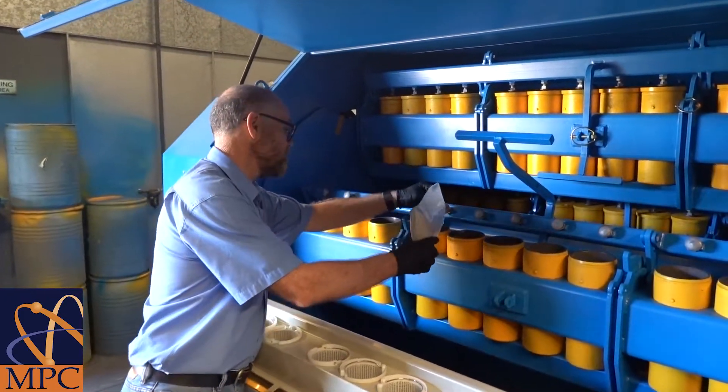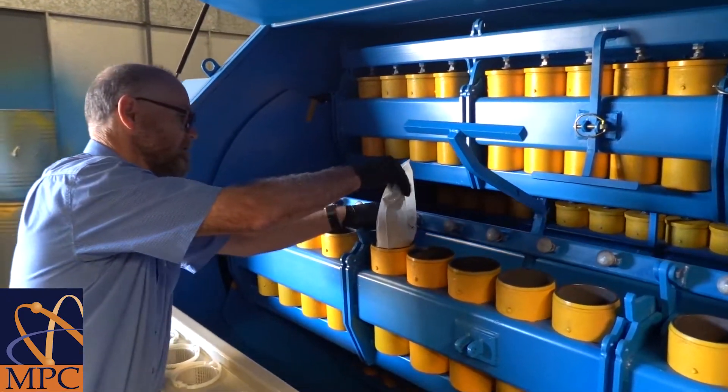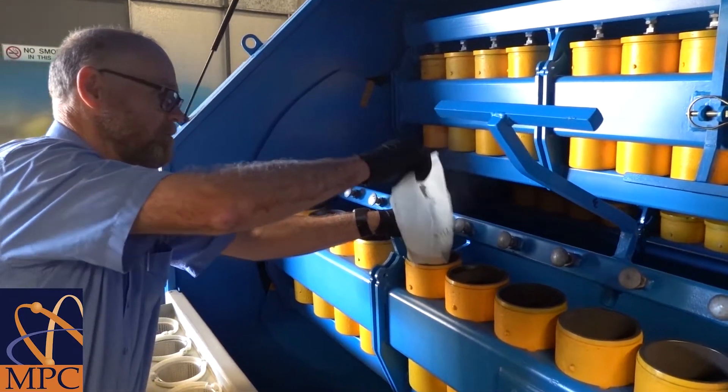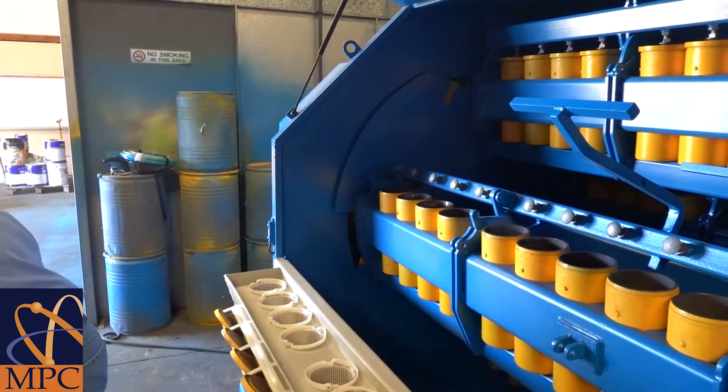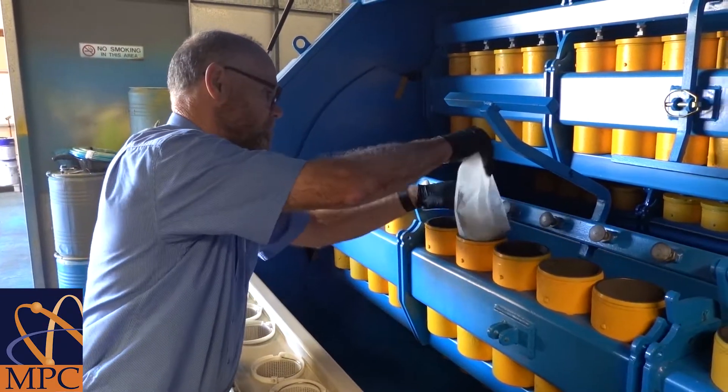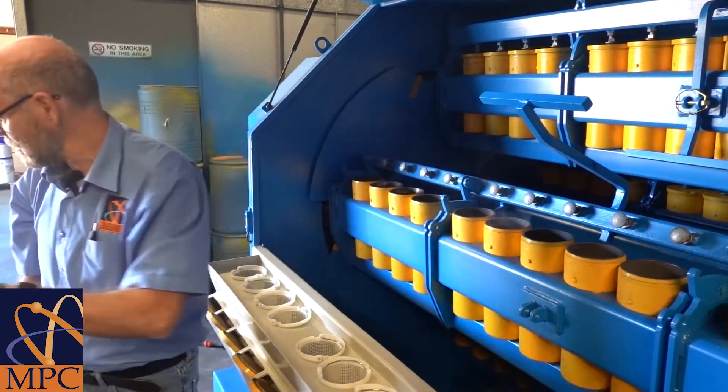Next, we add our sample into each of the pots. This is typically blast hole drill samples or RC drill chips — they're perfectly adequate. Sample mass up to one kilogram.